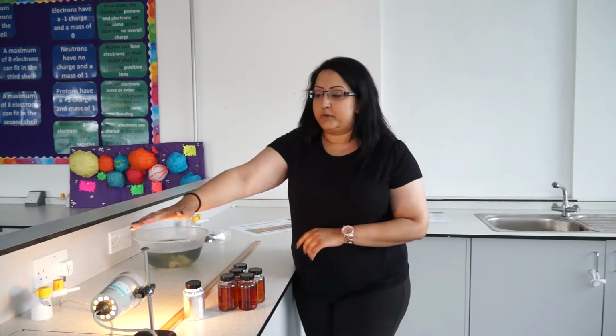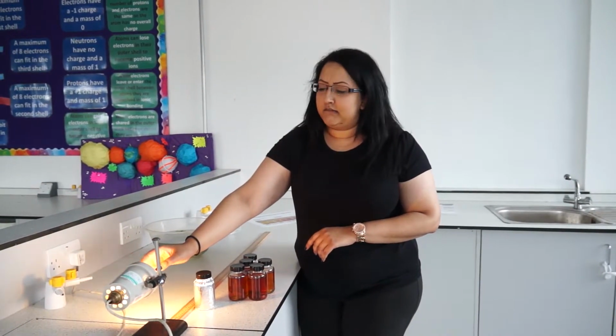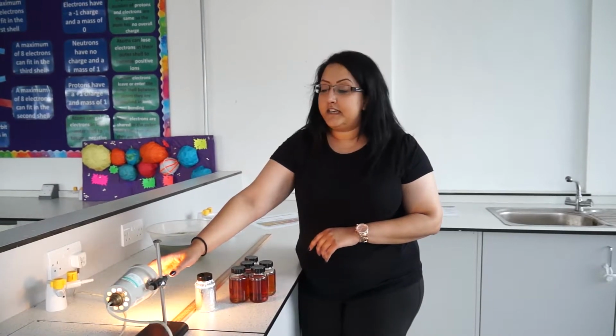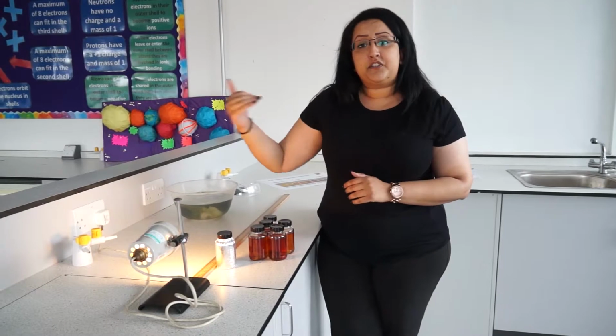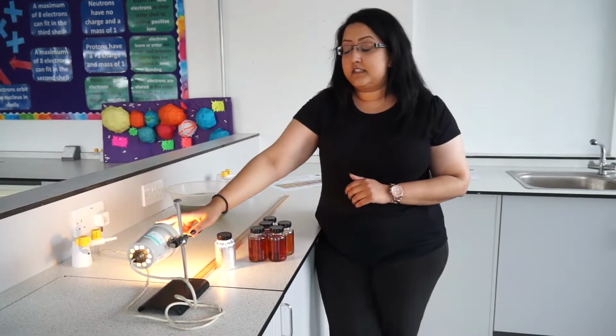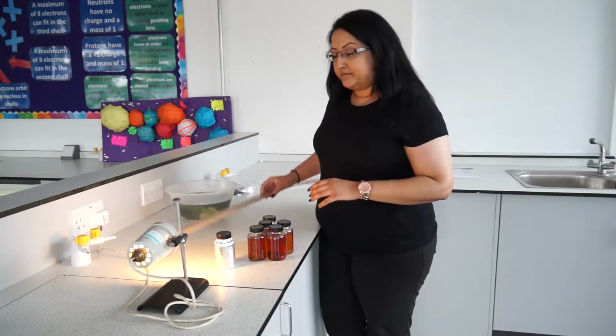You will need a light bulb. Now, this light has a heat filter on it. If you are given a light bulb that is just a regular light bulb, you need to ask your teacher for a heat filter. But because this is a special light bulb, we don't need a heat filter. You will need a meter stick.